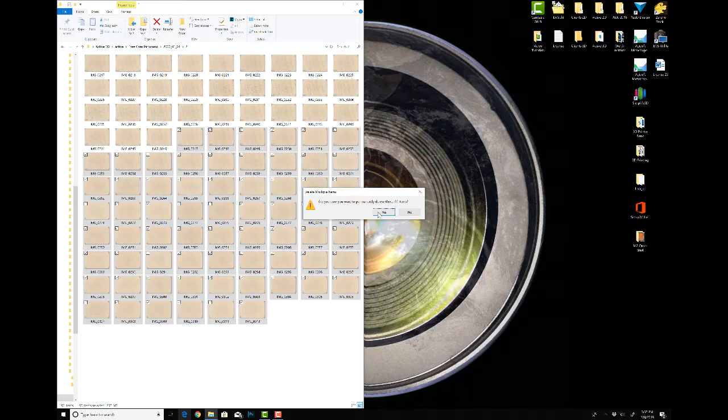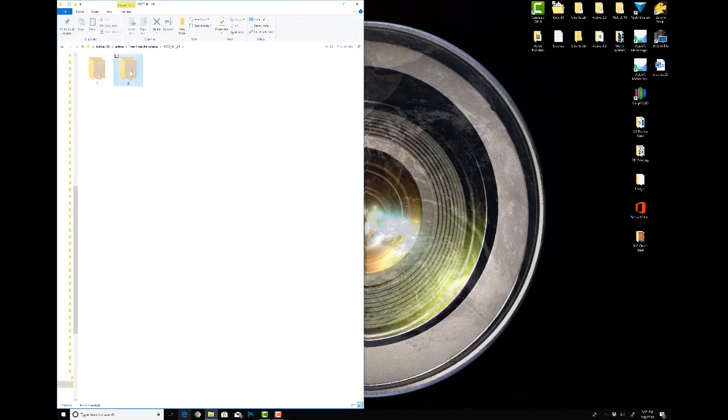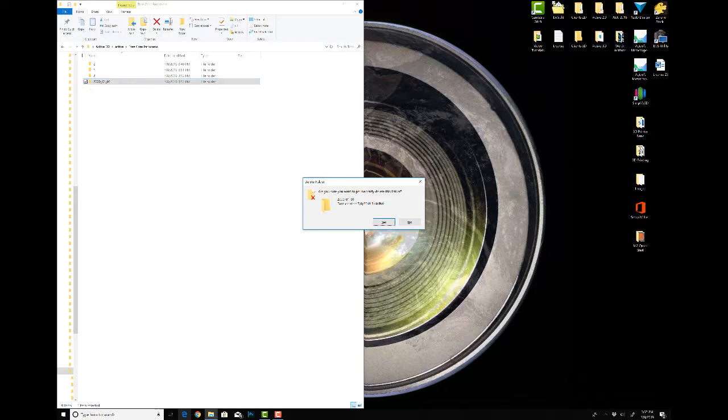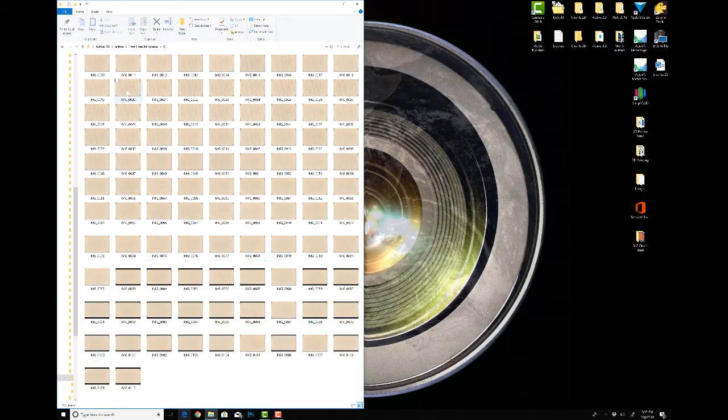One of the things we could do is take these folders and rename them, since we already have the other one. Actually, initially, if you set this to 0, that way these two folders can just go back into the main folder. Now you have 0, 1, 2. And theoretically, you're going to have folders 0 through 65. What we're going to do now is delete that folder, which is empty. We can go to the 0 and do the same thing if we didn't already.